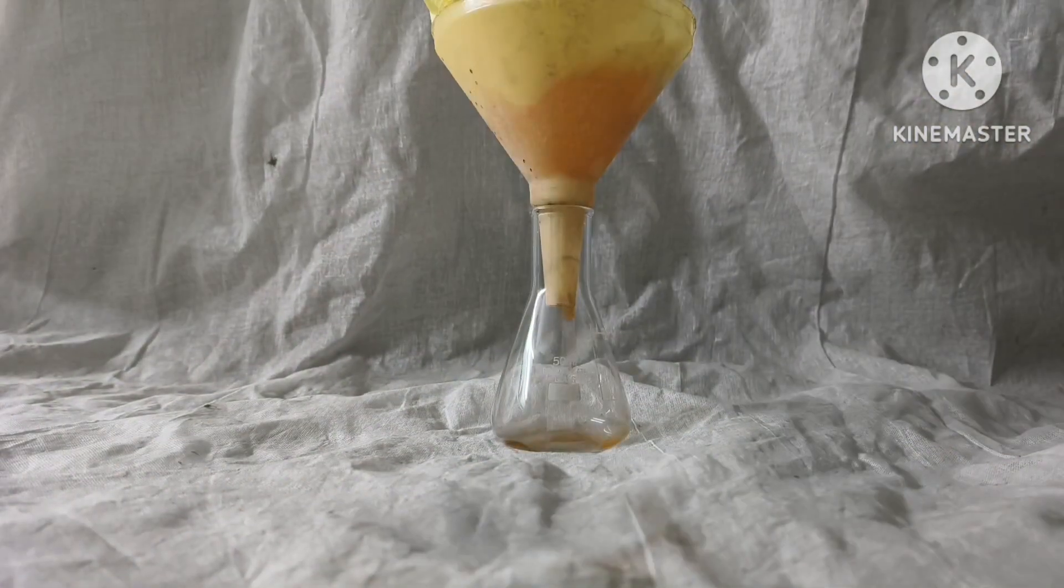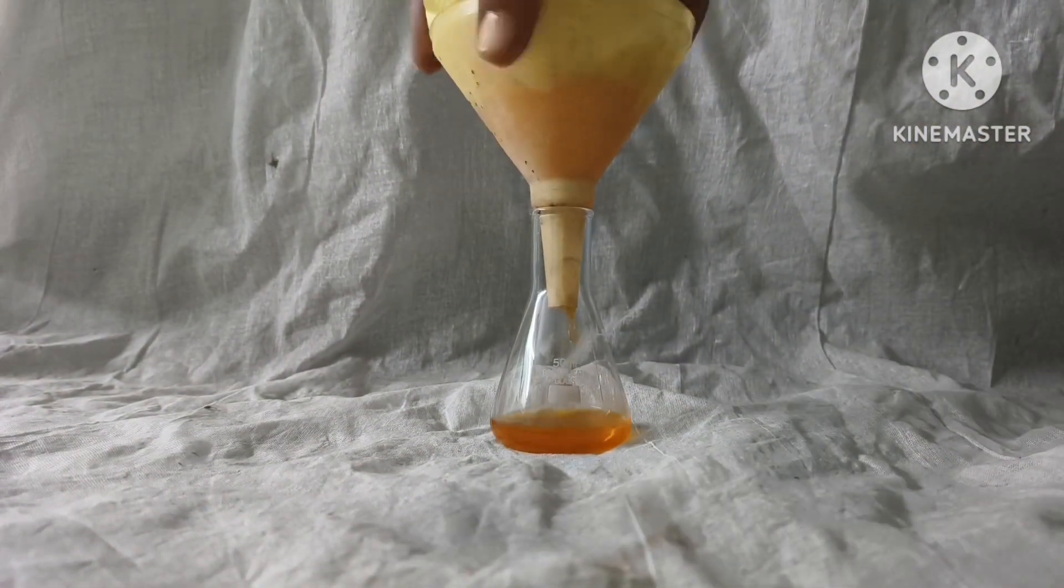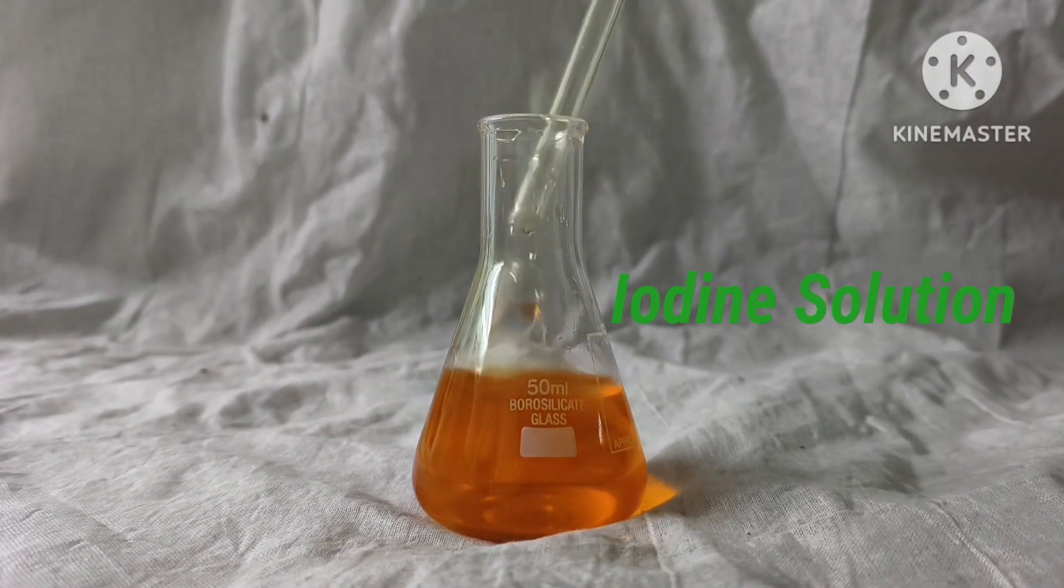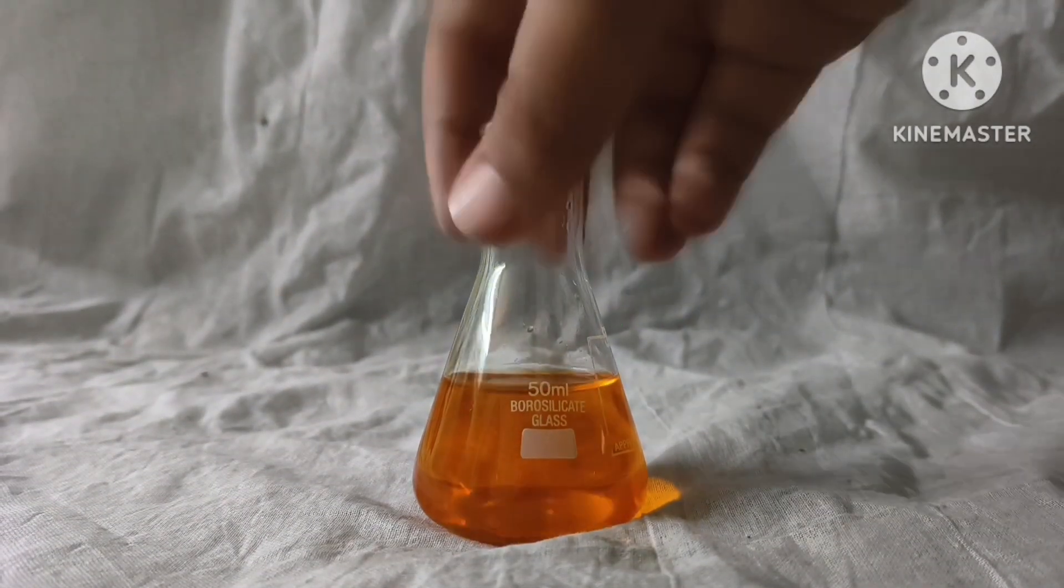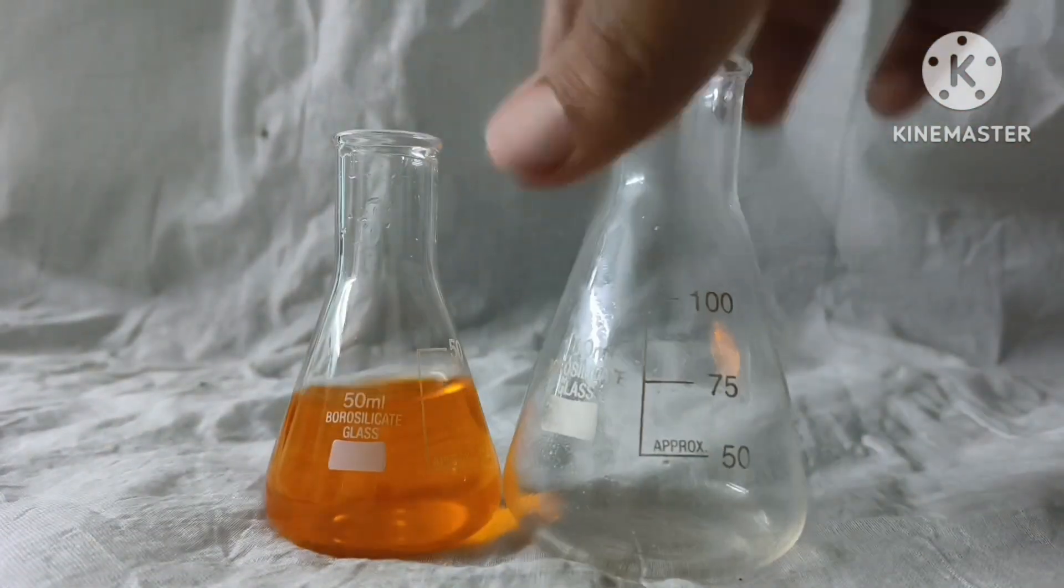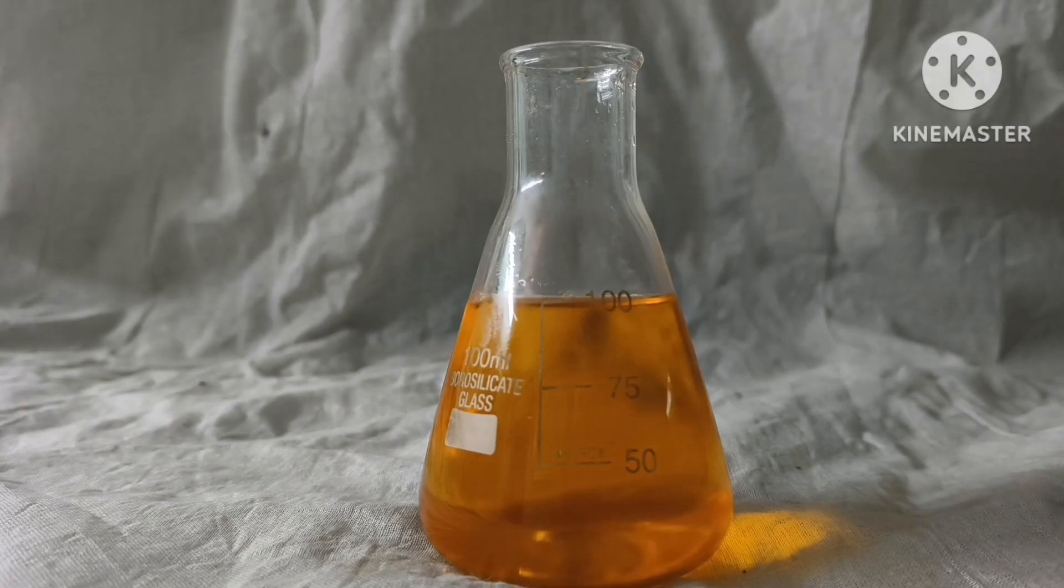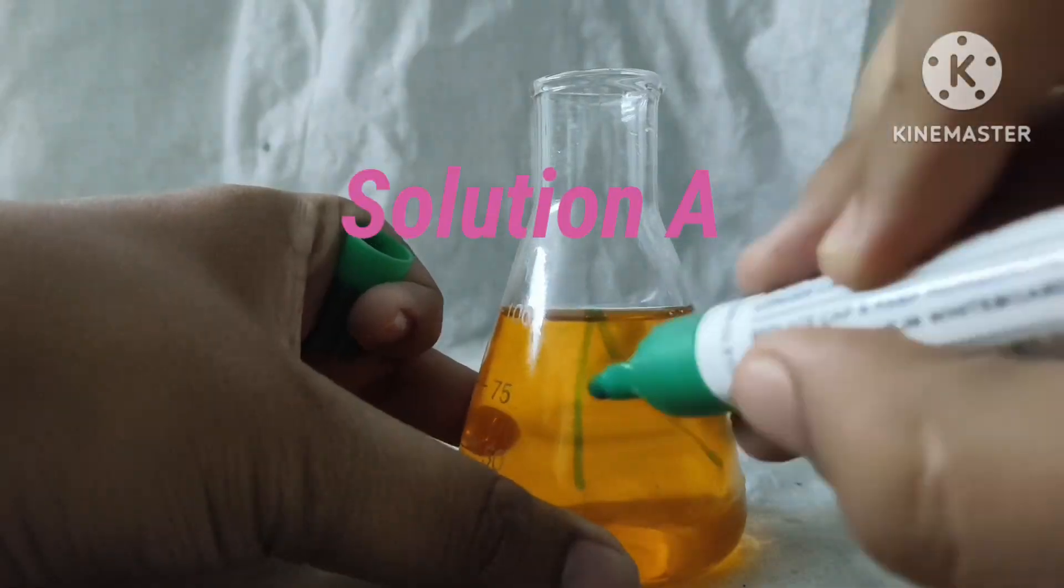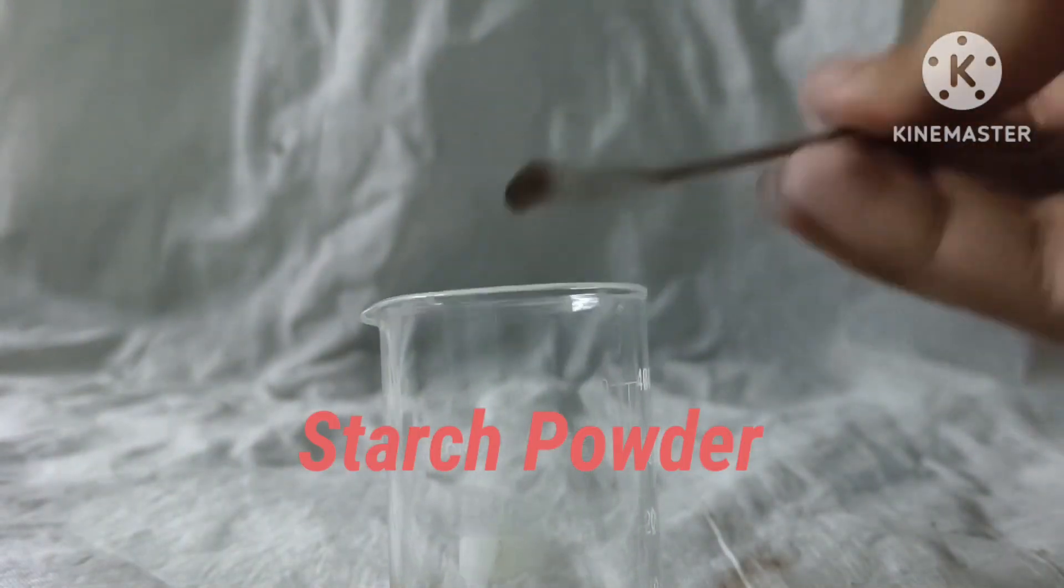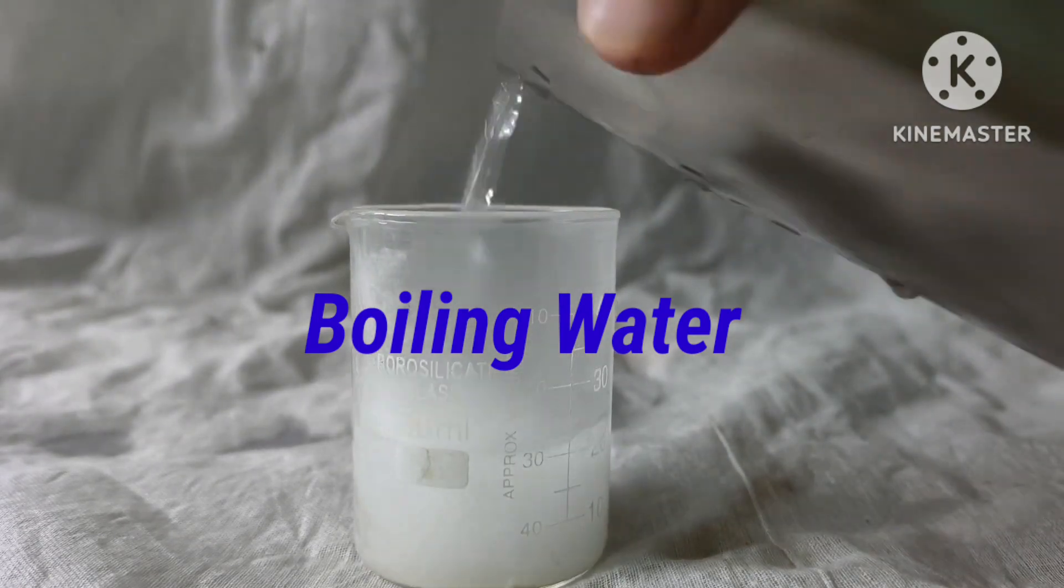I added some iodine solution. Now I added some distilled water and our solution is ready, and I marked it as solution A. I took corn starch in a beaker and added some boiling water, and filtered the solution with tissue paper to get better results.